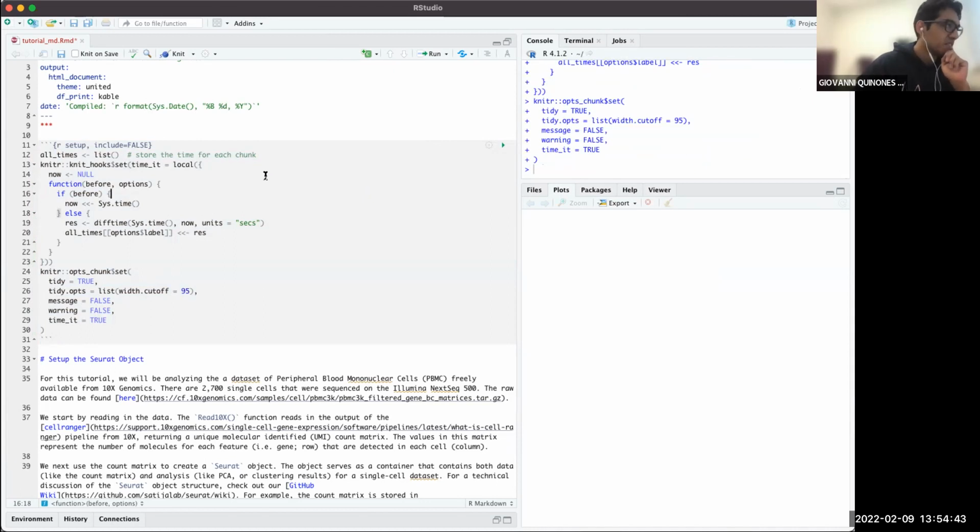This first cell should run fairly quickly. It's just loading the knitr package, which is involved with the different plots that we generate, the error messages, and some other setup for our code.